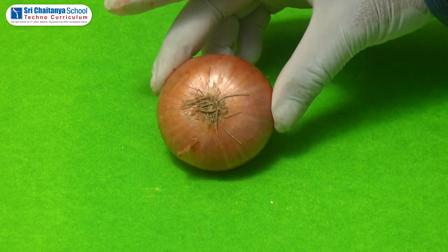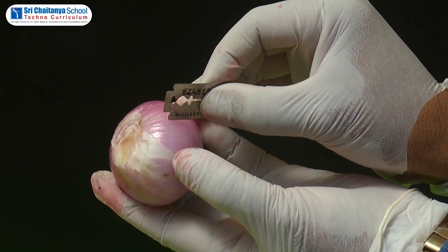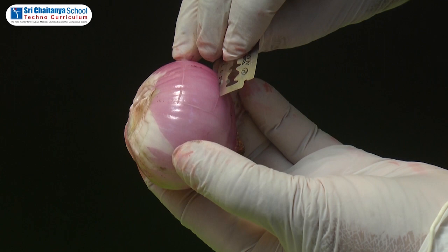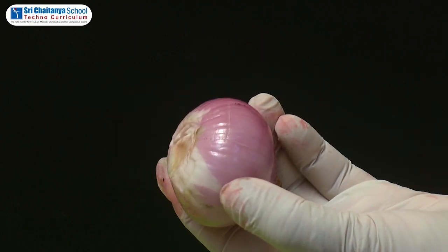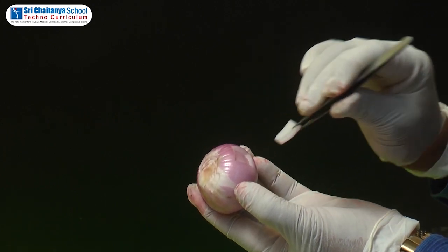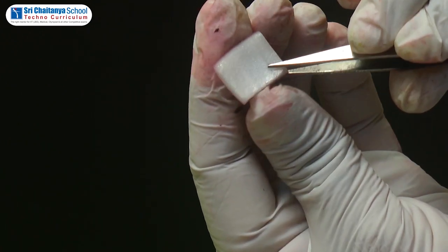To conduct this experiment we need to follow the procedure. First, we have to take an onion. Now cut the onion leaf with the help of a short blade, and remove the leaf peel with the help of forceps. From this peel, we have to take out the onion peel.